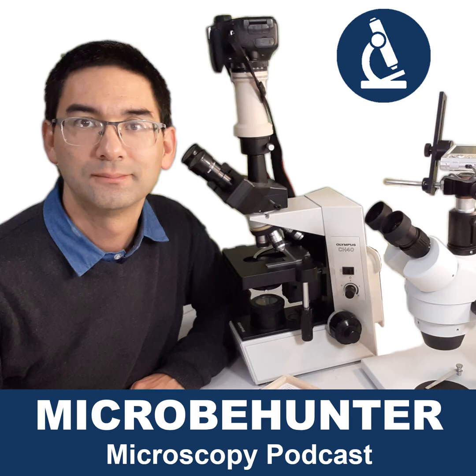And also, if you really want to do a lot of microscopy, I definitely recommend that you get a binocular microscope, because when you're sitting a long time behind the microscope, it's simply more convenient and more comfortable. Otherwise, get yourself a bright field microscope with achromatic objectives, 4 times, 10 times, 40 times at least. I personally also have a 20 times objective here, because 20 times is very good for observing water samples.